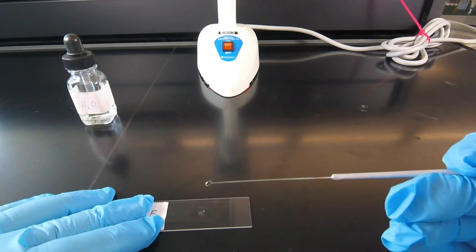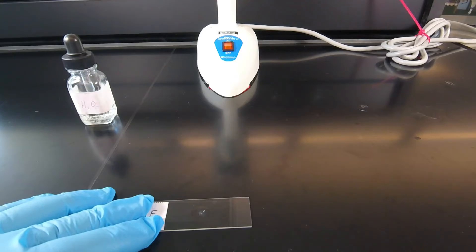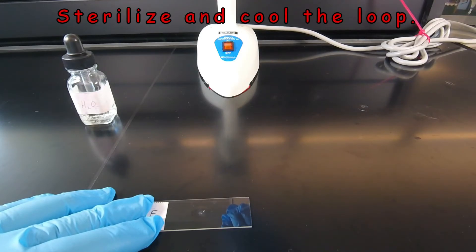We don't want to put all of this bacteria on because that defeats the purpose of the water. The smear will be too thick to stain properly. So what we're going to do is burn the remaining bacteria off the inoculating loop.